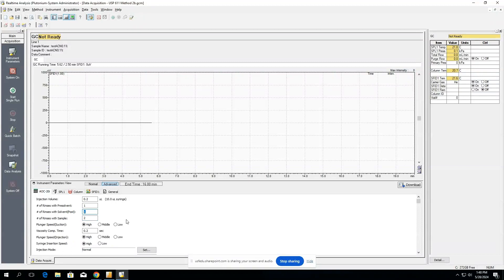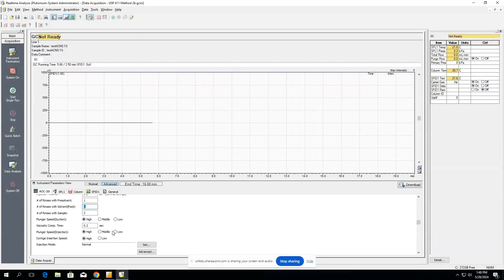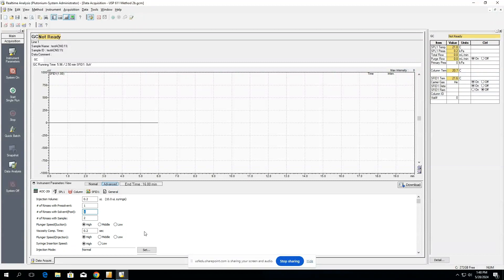All these other parameters can be changed if the viscosity of your sample is not ideal of a typical aqueous or organic solution, but typically high is okay for all of these. As you increase viscosity on your sample, you might want to lower these speeds because you might introduce bubbles. Everything else here should typically be okay.